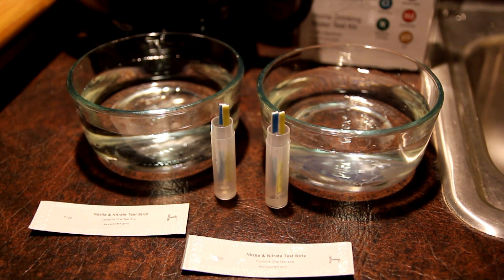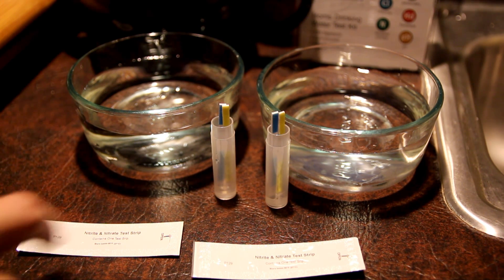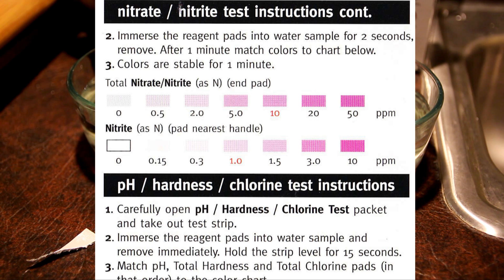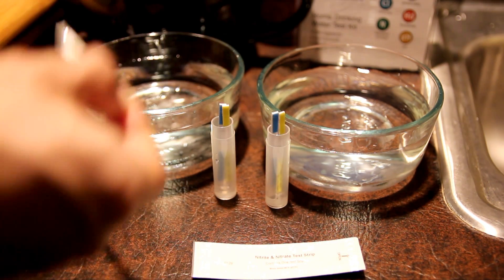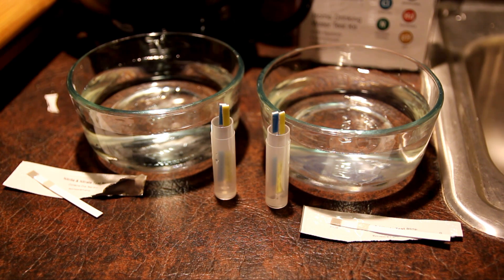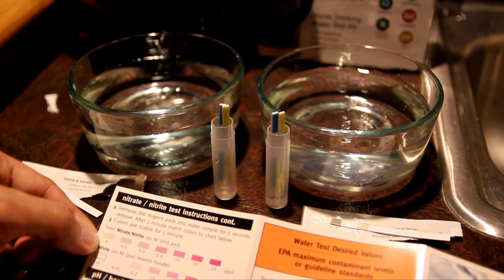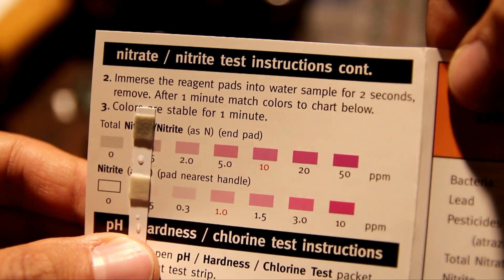I also set up the lead/pesticide test for the reverse osmosis water. Since I'm waiting 10 minutes, I'll go ahead and do the nitrate test. It's pretty simple — open it up, take the strip out, immerse it for two seconds, then remove it and wait one minute. After one minute, according to the chart, both the city water and the reverse osmosis water are at zero nitrate.